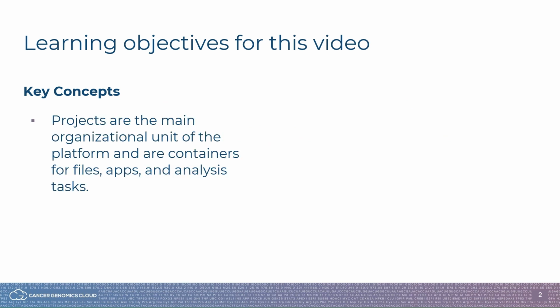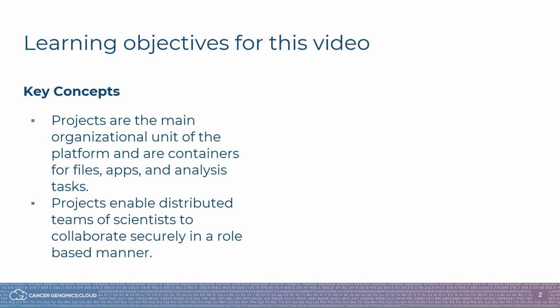The first is that projects are the main organizational unit of the platform, and you can think of them as containers for your files, apps, and your tasks. The second is that project membership enables distributed teams of scientists to collaborate securely in a role-based manner.